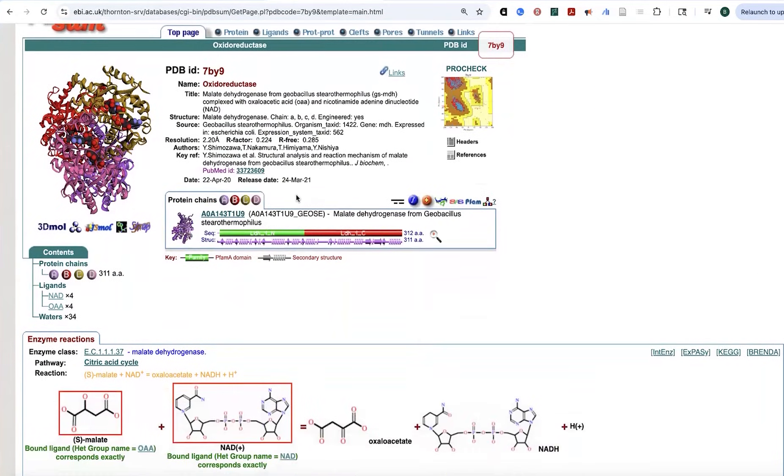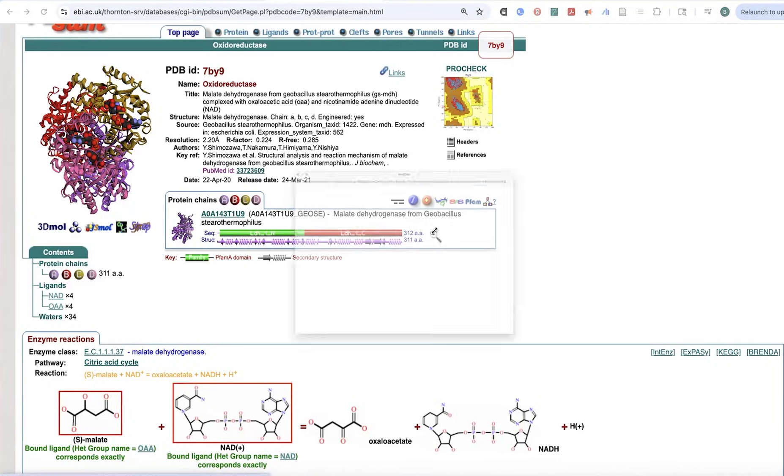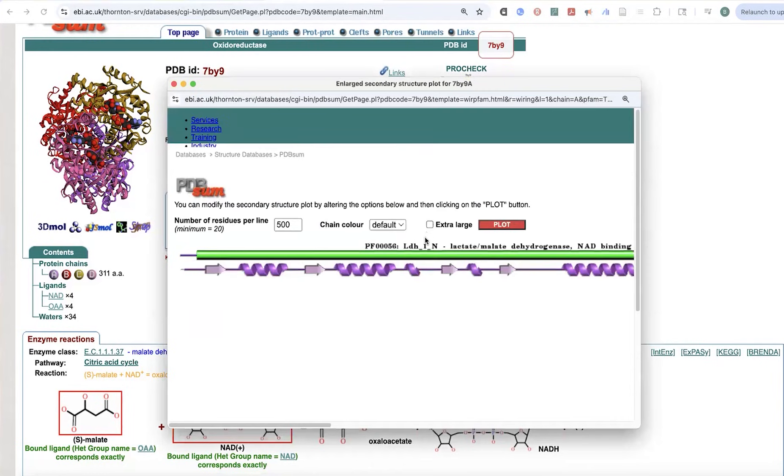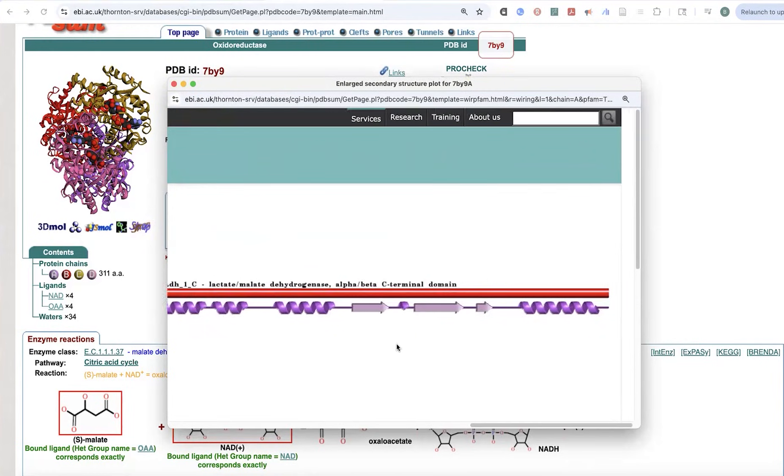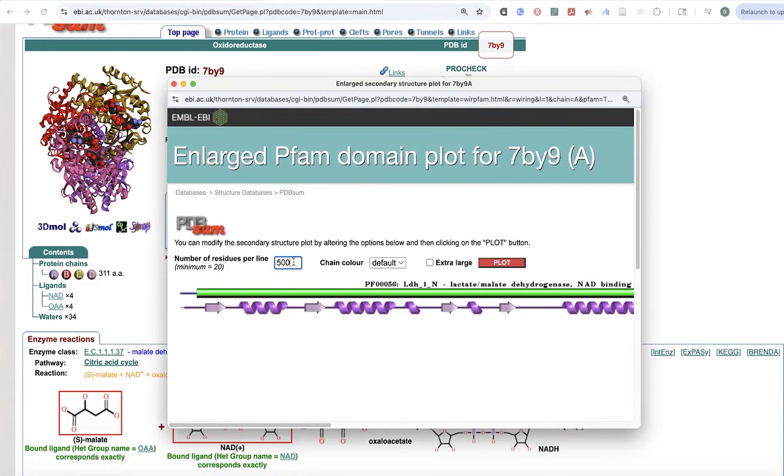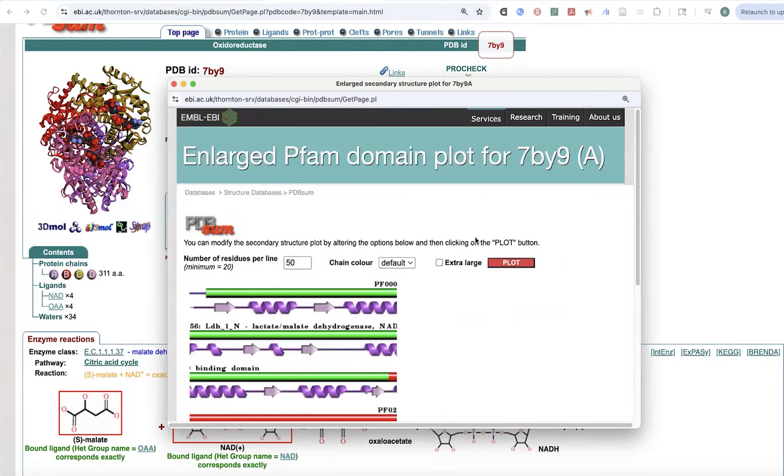So those kind of darker regions are the angles that the peptide backbone normally takes for those amino acid combinations. Over here, what we see is that we have this domain architecture. So these are the annotated domains. And then under here, we have the secondary structure. If I click for a larger version, what I see is something like this.